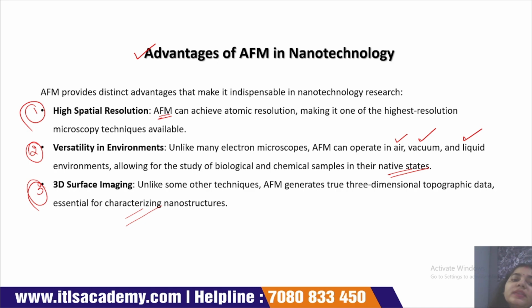Next is 3D surface imaging. With this technique, we easily generate 3D topographical data of our sample, and this data is very helpful for the characterization of nanoparticles or nanostructures.